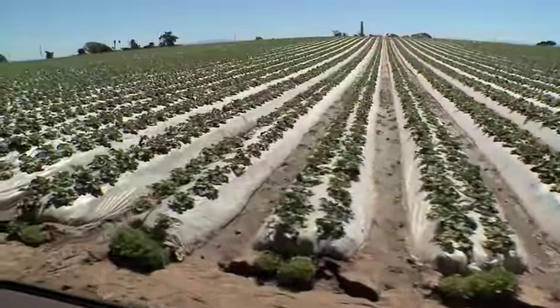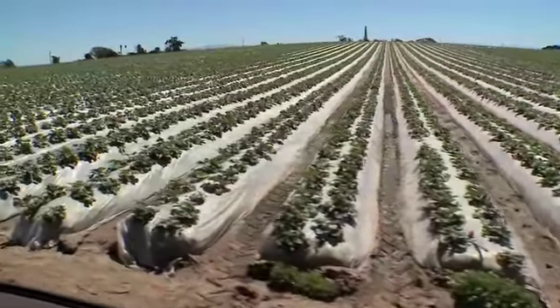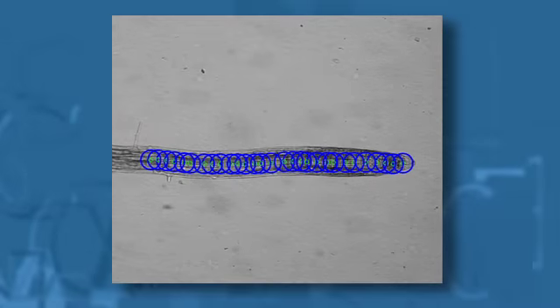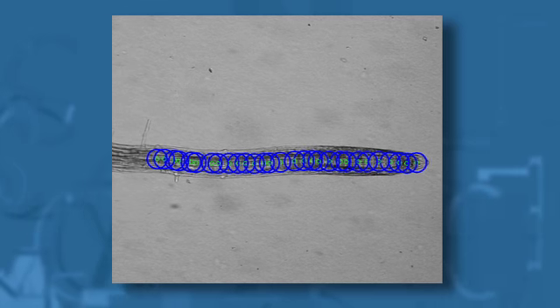By using so-called computer vision or machine vision to track their growth and development, we can get at the genes that control root growth, and those hopefully will have fundamental importance to crop improvement. It lays the foundation for potential discoveries that will help improve plants for human purposes.